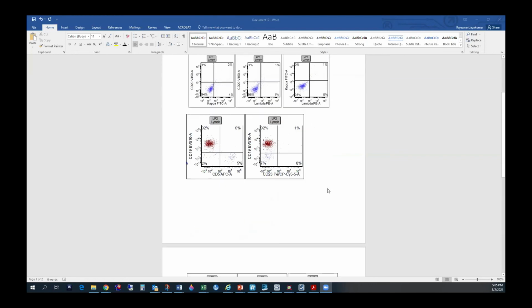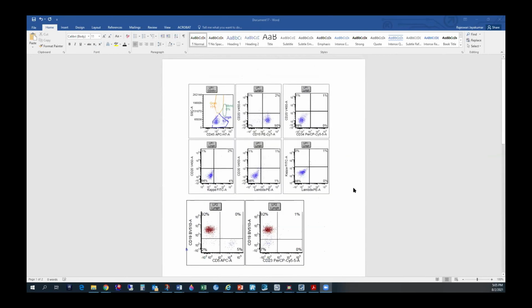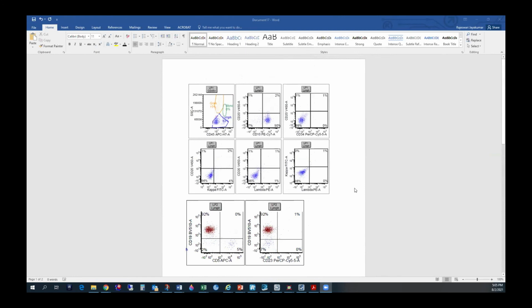And why I was saying that I wanted to see other markers as well is because they can have some aberrancies, and some myeloid antigens they can acquire as well. Those aberrancies sometimes help. TdT may or may not help. CD34 may or may not help. People sometimes acquire CD13 and CD33. That's an aberrant marker in B-ALL, right. But we never ran that tube because we just didn't have tissue.